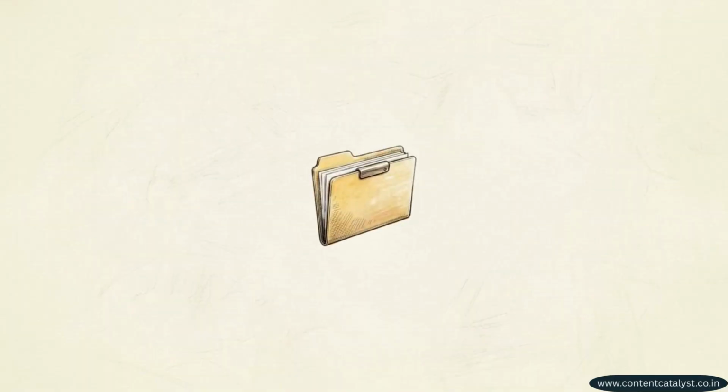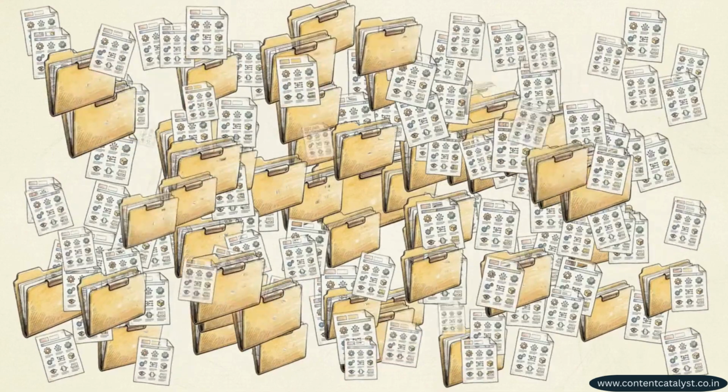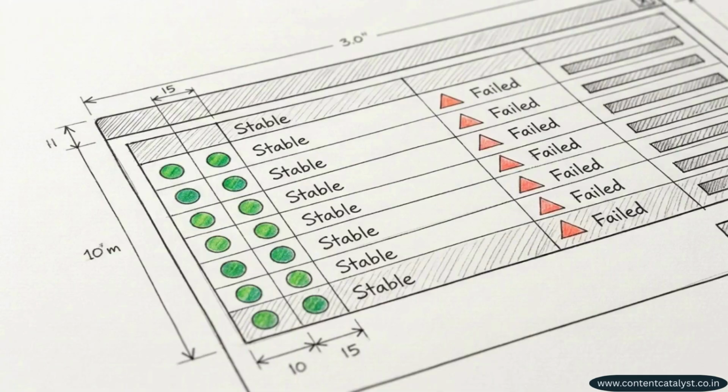The reality of Rietveld refinement is heavily iterative. A single project rapidly spawns dozens of test folders, intermediate parameters, and discarded runs. When analytical software makes this iteration difficult to organize, researchers lose track of what parameters produced which outputs, entirely destroying the reproducibility of the analysis.